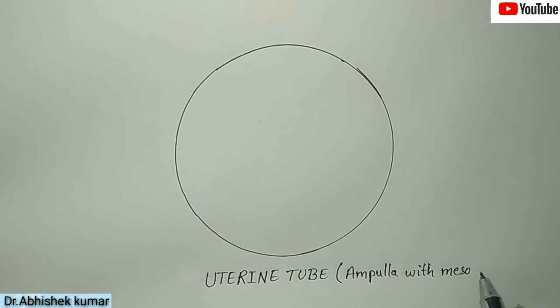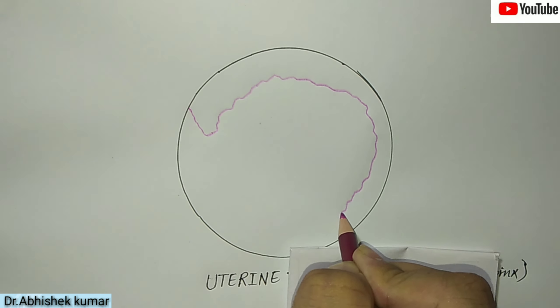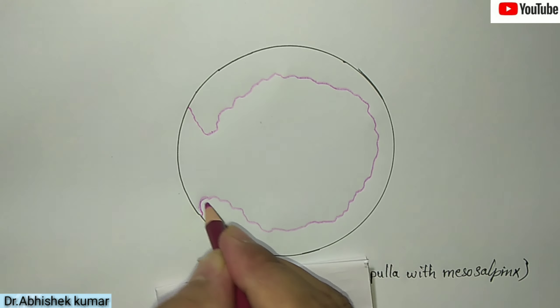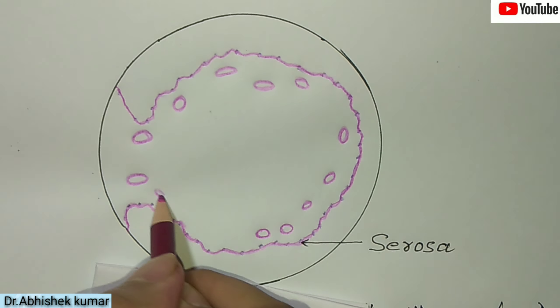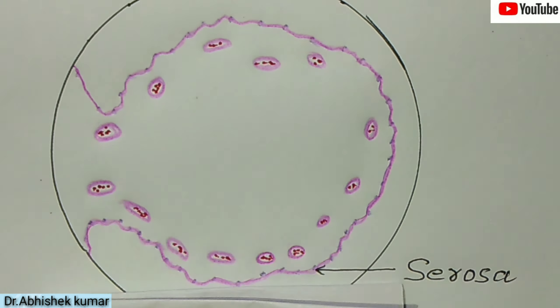Here we will see the ampulla with the mesosalpinx. This outer structure is the serosa of the visceral peritoneum — the outermost layer of the uterine tube — which is connected to the mesosalpinx ligament of the superior margin of the broad ligament. Numerous arterioles and venules are present here.